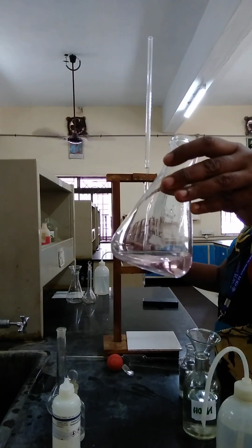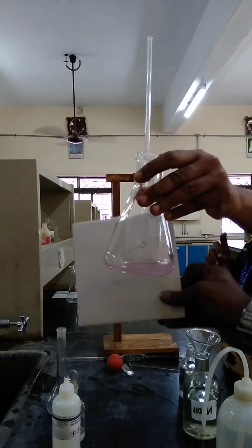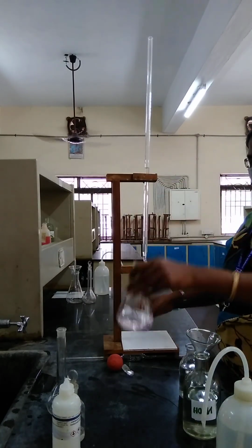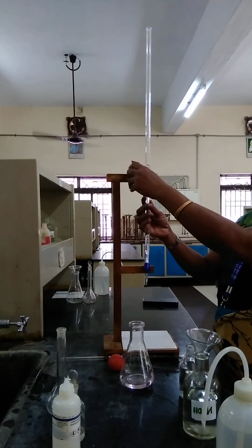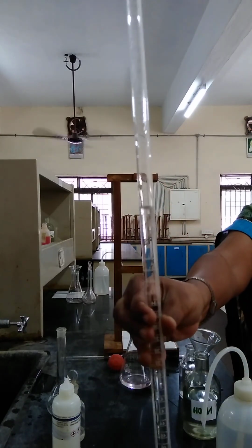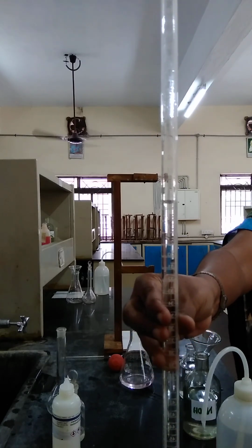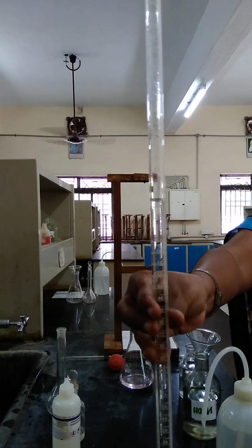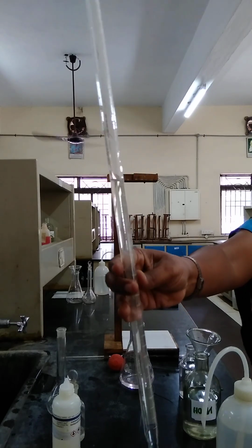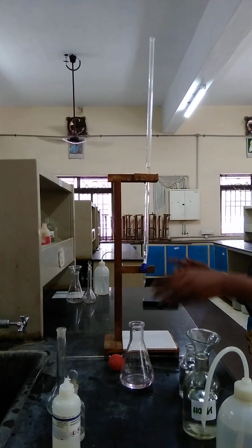So that is the reason, when we get the pink color, you see how the pink is. That is more than enough. The pink color appears permanently. So stop the titration, note down the value. Whatever value it's showing, actually due to the colorless solution, it's the lower meniscus, 25.5, right? You can note down the reading. First titration, 25.5.